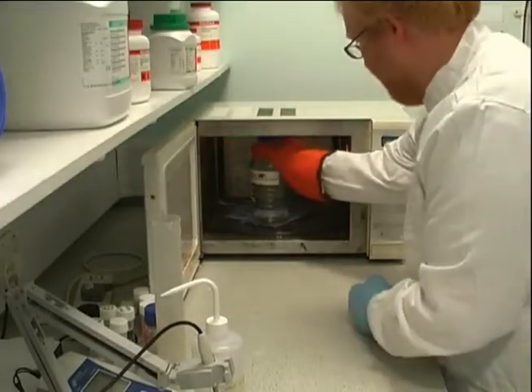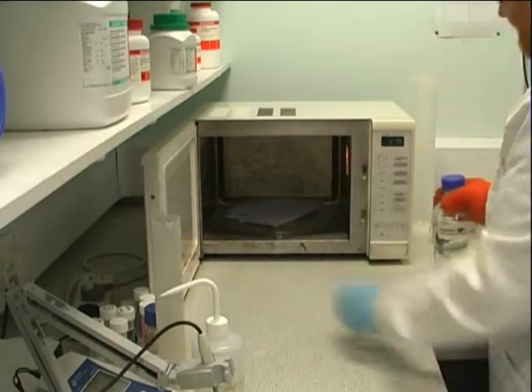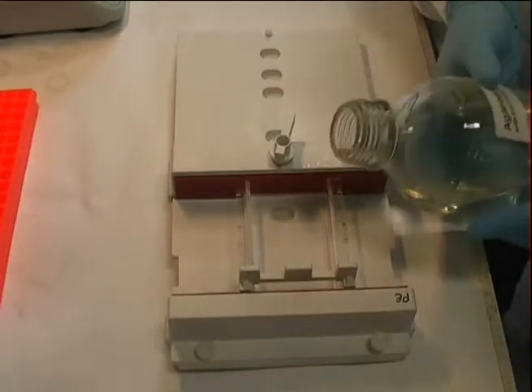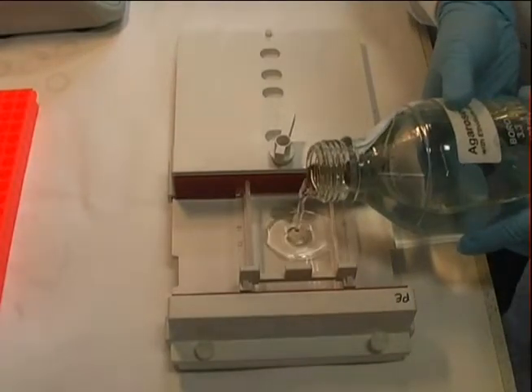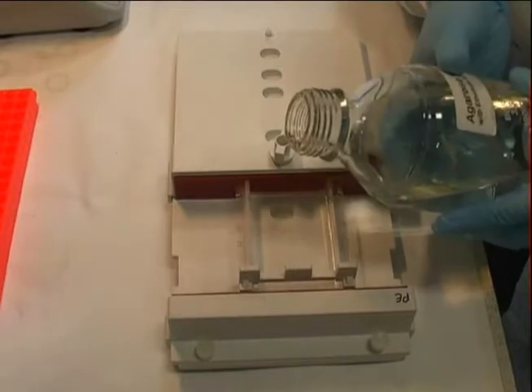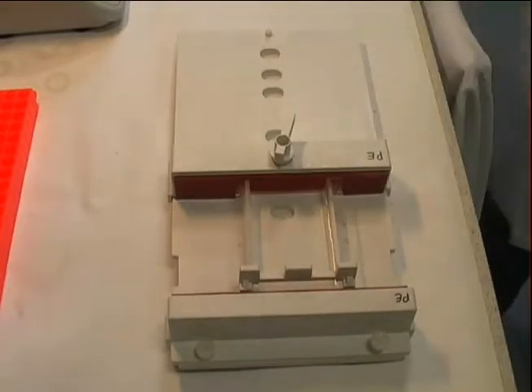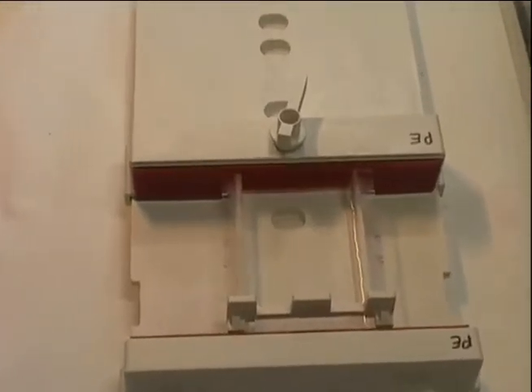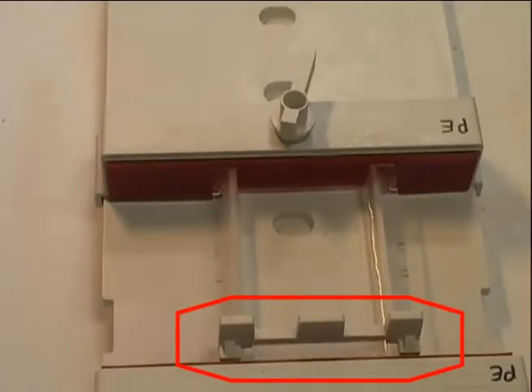In order to analyze a newly synthesized DNA, it is necessary to prepare an agarose gel for electrophoresis. The liquid molten gel is poured into the casting rig, which will set the cooling gel into a semi-solid state, ready for the DNA to be loaded onto it. As part of the casting rig, a comb, highlighted in the video, is placed to allow the setting gel to form around it and mold lanes in which the DNA will be placed.